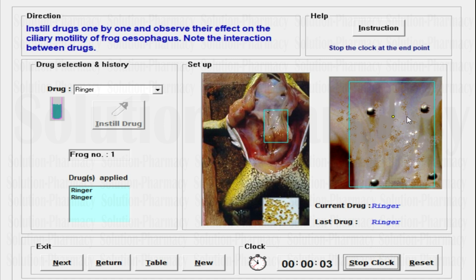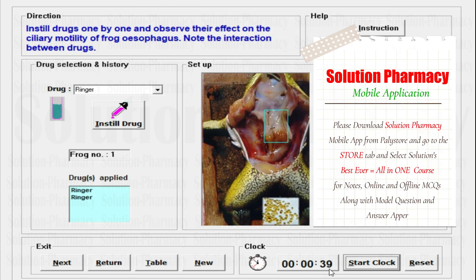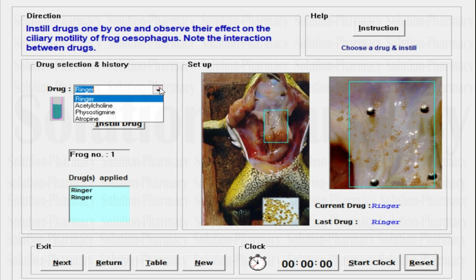Observe two things: you have a clear view of a seed in yellow color moving down toward the end side. The circle is the start point and the boundary line is the end point. You have to start the stopwatch at the start point and stop it at the end point, noting the exact time taken. The seed will fall down, and once it crosses the borderline, click the Stop Clock button. The motility of that seed with Ringer solution is found to be 39 seconds — note this down.